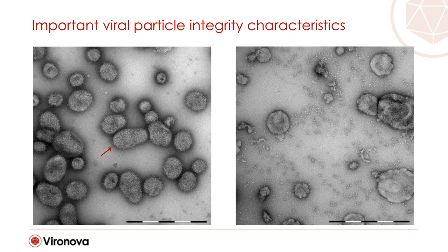And sometimes you need to go deeper into the structure to get a good classification, looking into the fine structural details. Here to the left, you have a nice looking influenza sample with nicely decorated particles where you can clearly see the spikes on the surface.